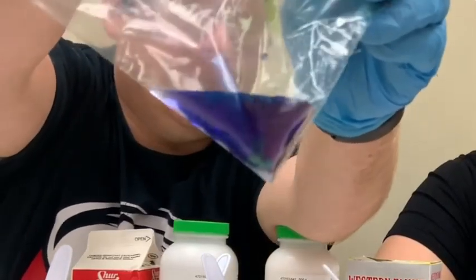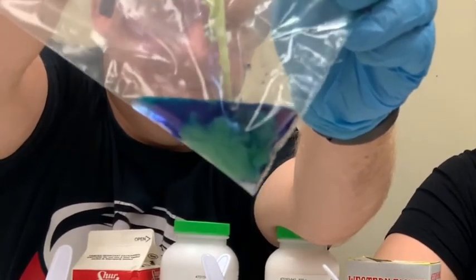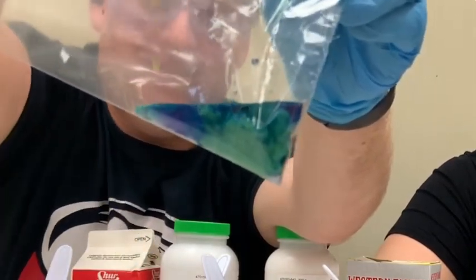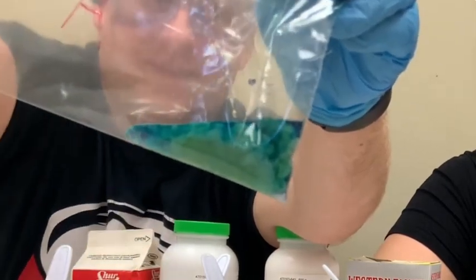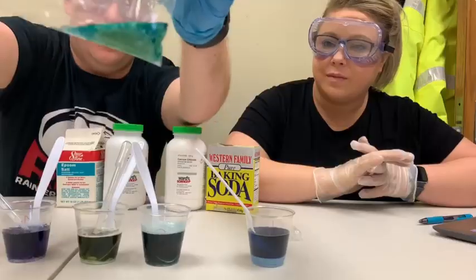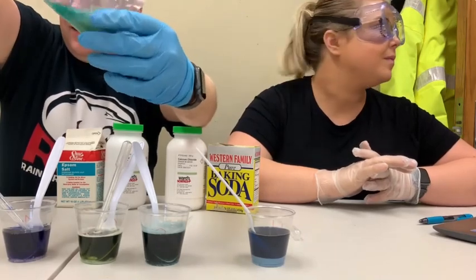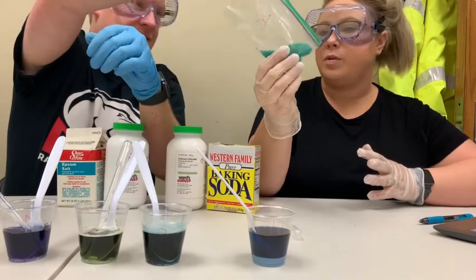Oh, look at that. So 2 more. It looks like I can see some precipitate forming. And number 3. Yeah, so there's definitely something solid in there now. Now I'm going to seal this up so we don't spill. And I don't feel any temperature change. What about you? Nope, no temperature change.